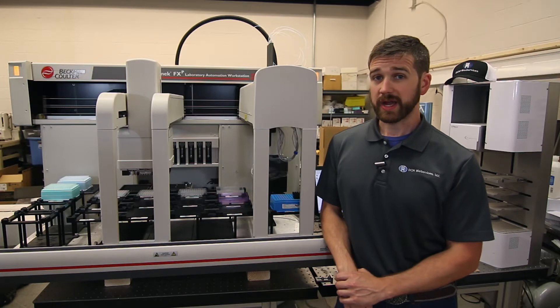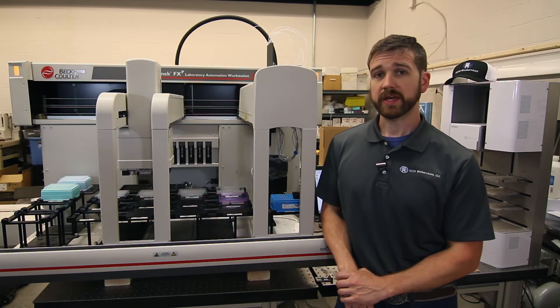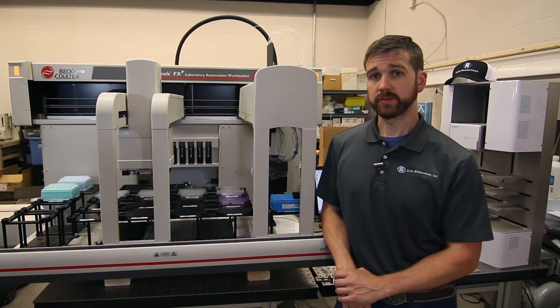Depending on the age of your Biomech, it's possible that the grippers aren't replaceable. Fortunately, if you do need the grippers replaced, the pod can be upgraded to the newer replaceable gripper styles.